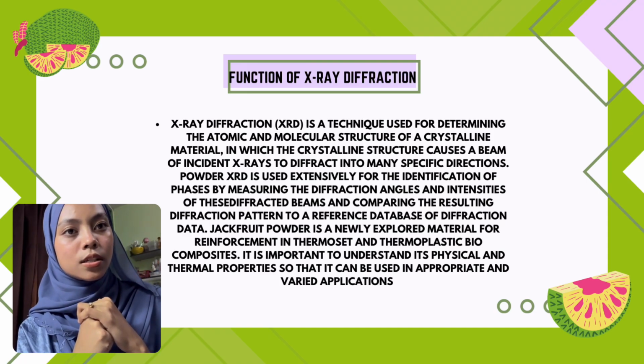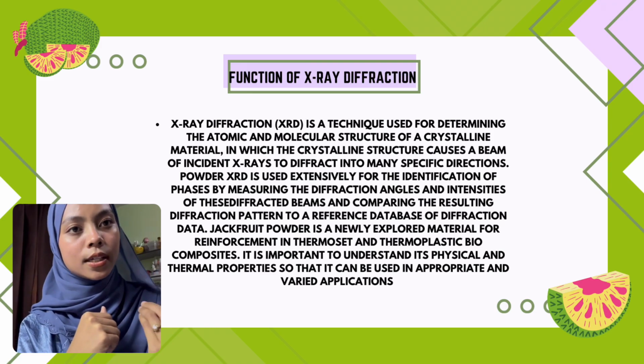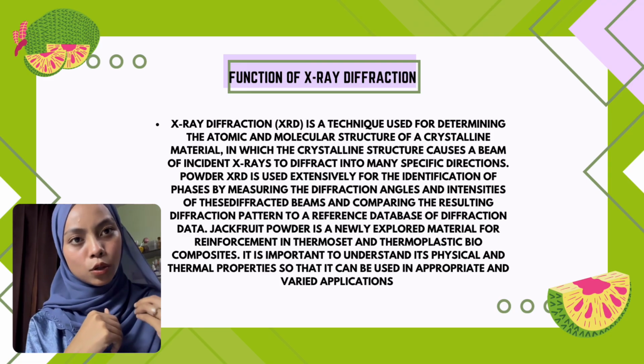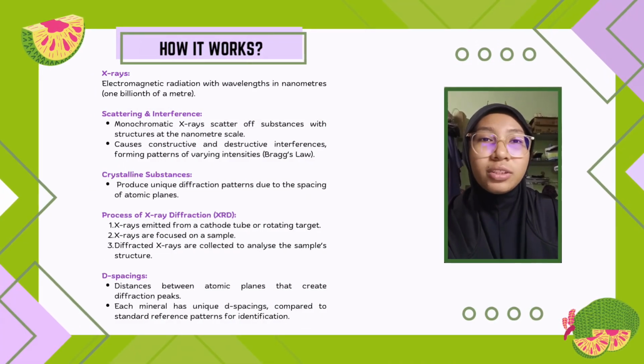Jackfruit powder is a newly explored material for reinforcement in thermoset and thermoplastic biocomposites. It is important to understand its physical and thermal properties so that it can be used and approached in various applications. Next, let's talk about how XRD works.